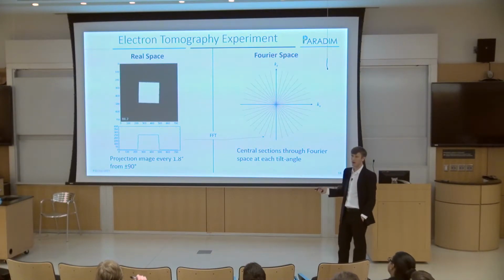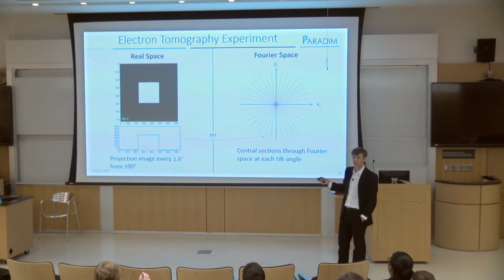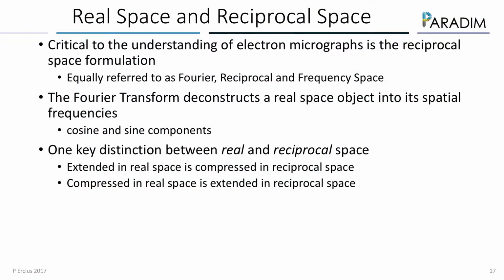So now if we change the rotation of that, we can see how the information we get from our different projections changes. It's no longer the same shape, right? We can get something else. And so each one of these corresponds exactly to just sampling that object along different orientations, along exactly the same place, okay? And I can show you that in the next couple of slides.